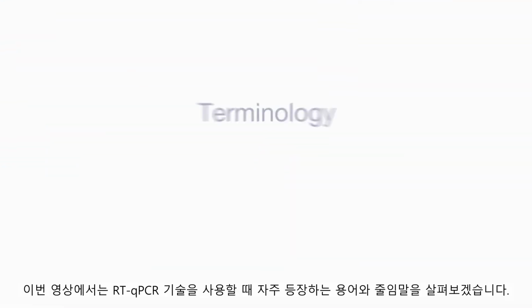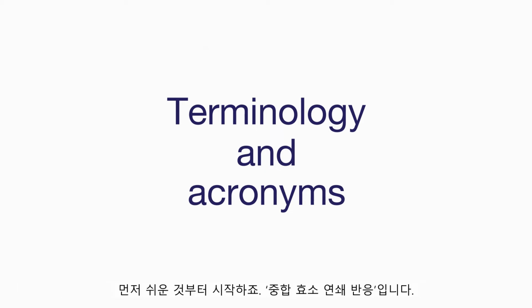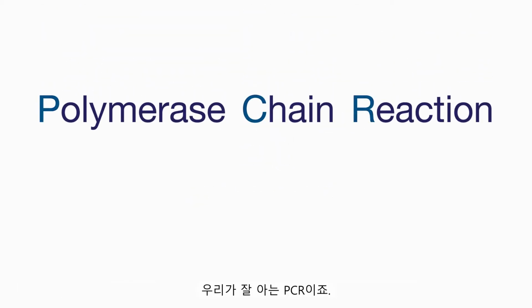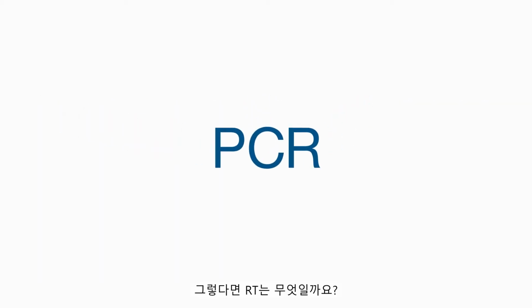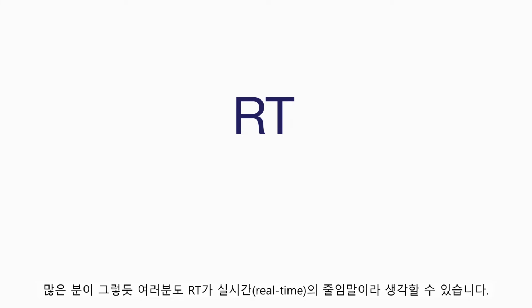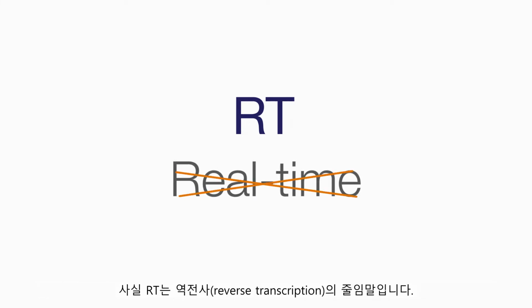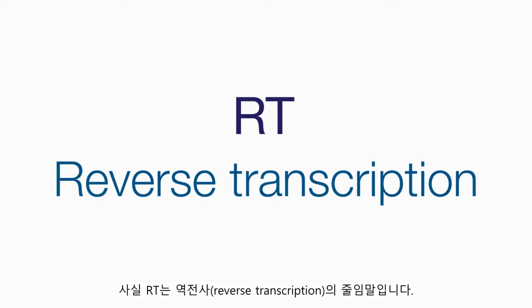Let's talk through it and discuss some of the common terminology and acronyms that you will encounter when using this technology. Let's start with an easy one, polymerase chain reaction. That's our good friend, PCR. Okay, what about RT? Like many people, you may assume that RT is short for real time. RT is actually an acronym for reverse transcription.